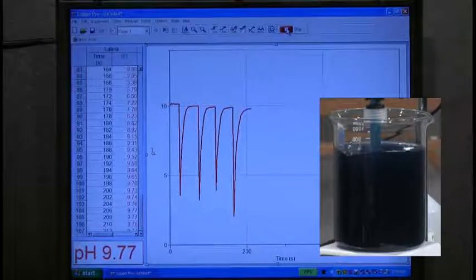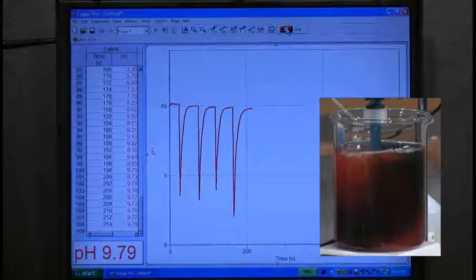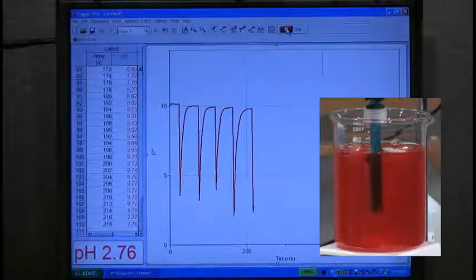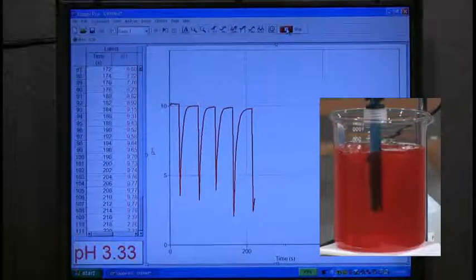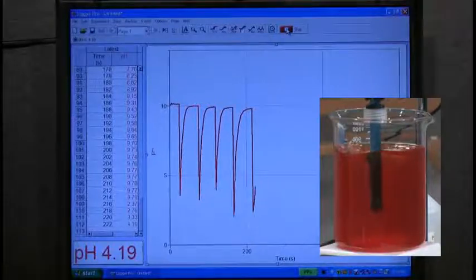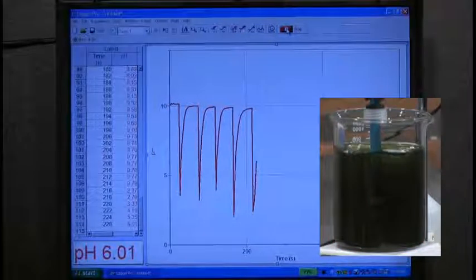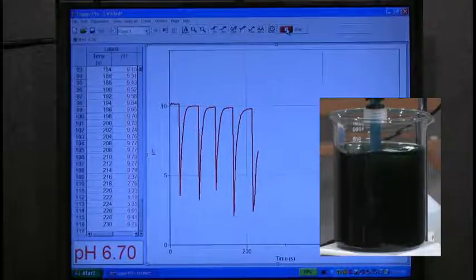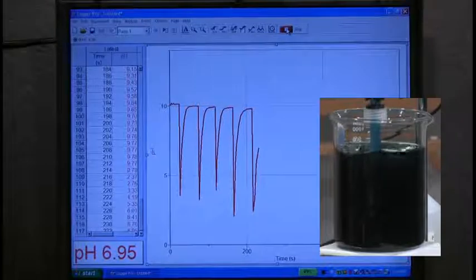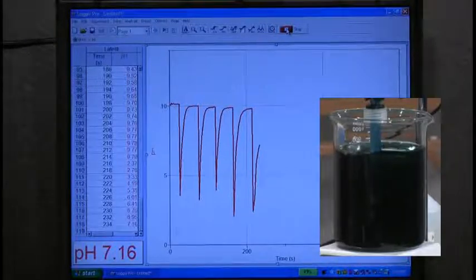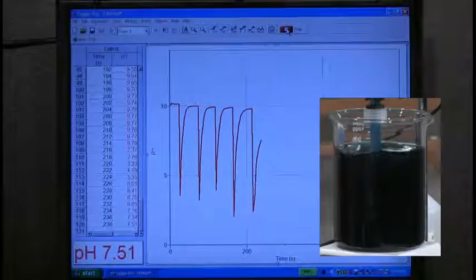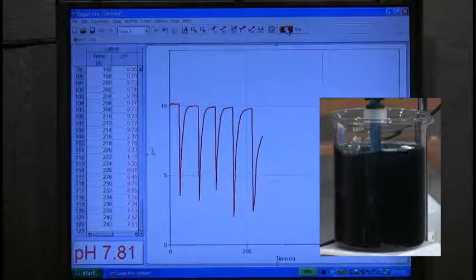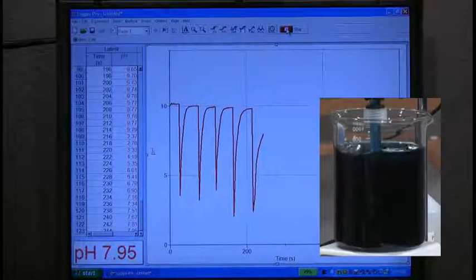Okay, we're just about back to as purple as we're going to get. Oh, my. Have we hit? Oh. Well, pretty green. So, pretty neutral. But it's turning blue. And, well, I suppose one more.